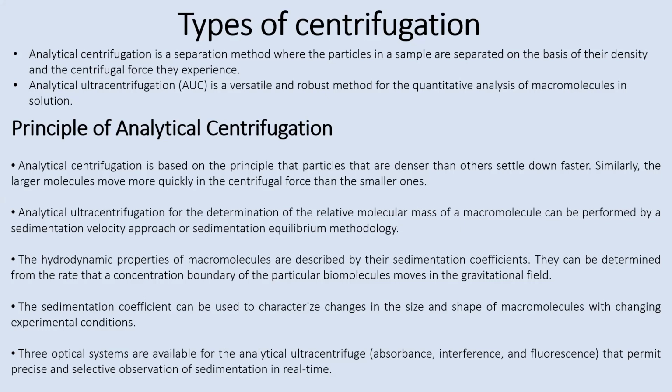So are you getting more absorbance in the supernatant? While the centrifugation is still happening inside, there is a device inside which is going to measure the absorbance also. So what is the pellet absorbance, what is the absorbance of the supernatant? Every molecule, as we studied in the spectrophotometer, is excited at a particular wavelength. So if you're working on ribosomes or any other protein, it will have a particular wavelength at which it will resonate and get excited. So what is that absorbance?